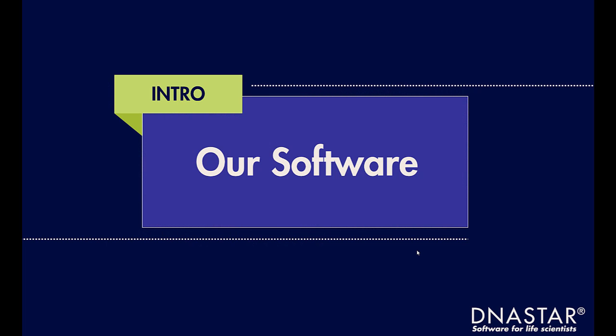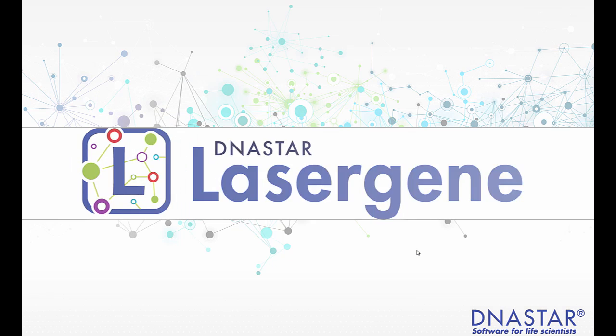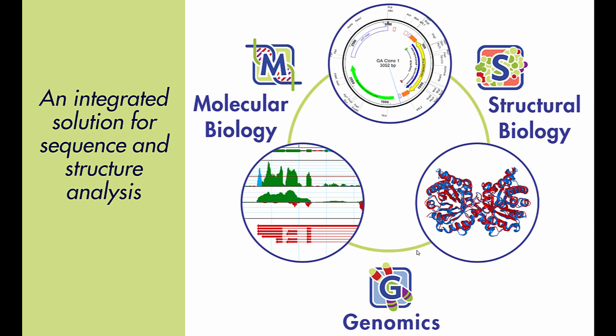So just a brief introduction to our software. DNASTAR LaserGene is our flagship product and consists of three major components. Our molecular biology suite, which handles everything from cloning and primer design to Sanger sequence assembly and analysis to multiple sequence alignment and phylogenetic tree creation. This integrates with our genomics suite, which handles a variety of next-gen sequencing applications and technologies, both assembly and downstream analysis in one integrated package. And finally, our structural biology suite contains tools for protein sequence and structure analysis, as well as protein structure prediction.